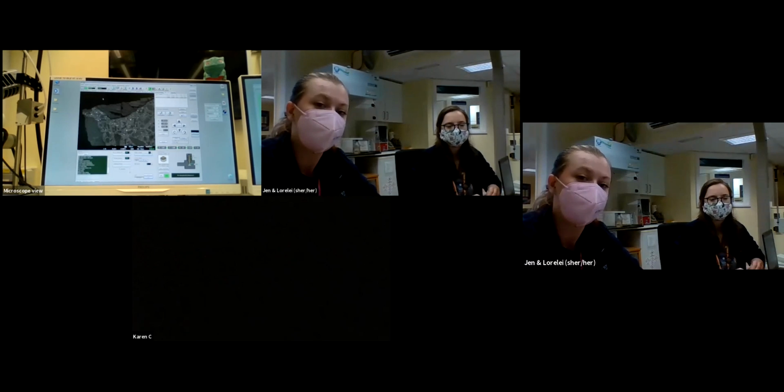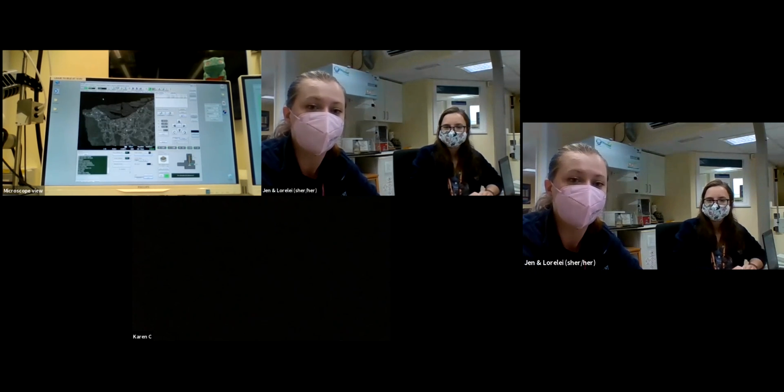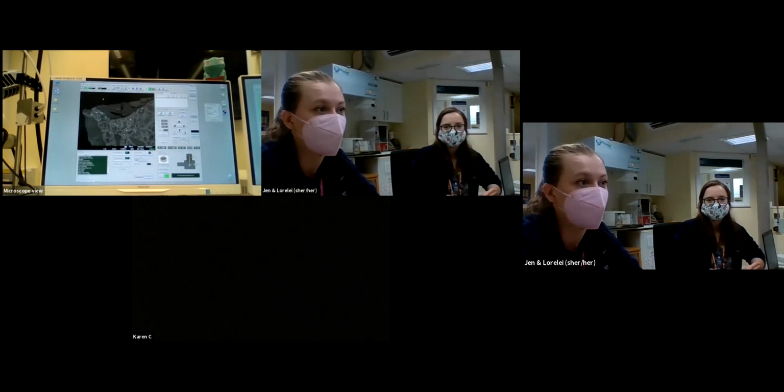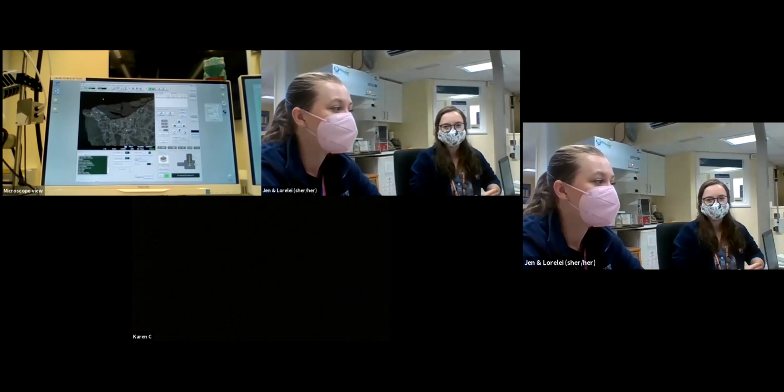And what we're going to do is use all the data we collect today to make a little handout, which we'll send around to you along with the recording of today's session. So you can see what you've done, because we will be doing some actual science, which for us is very exciting.